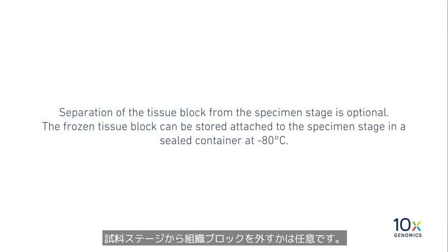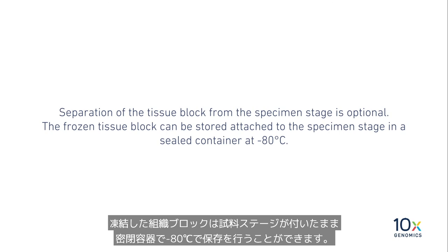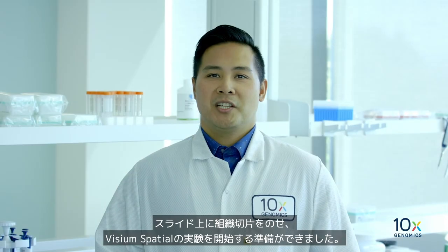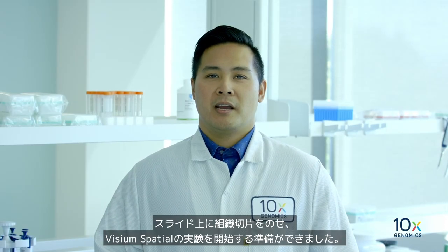Separation of the tissue block from the specimen stage is optional. The frozen tissue block can be stored attached to a specimen stage in a sealed container at minus 80 degrees Celsius. We have placed the tissue sections on the slide and are now ready to begin the Visium Spatial protocol.